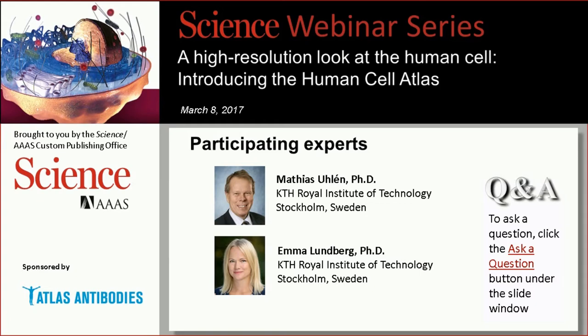So thank you for that question. What we are doing, I think, is a rather unique approach to actually probe and spatially localize all the proteins using antibodies, but also to integrate it with other types of technologies, including proteomics and transcriptomics.